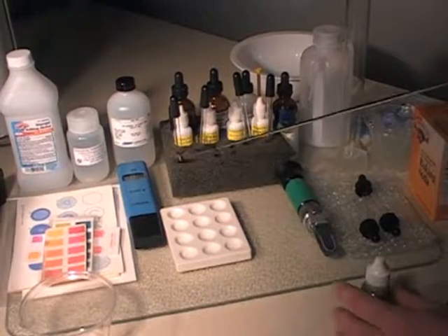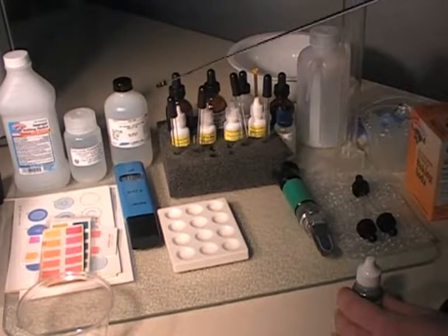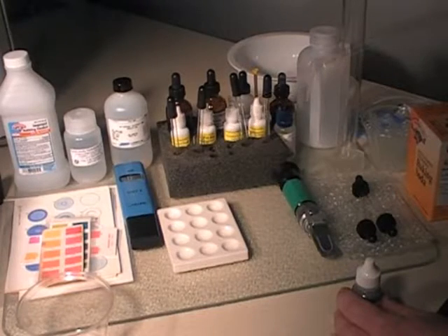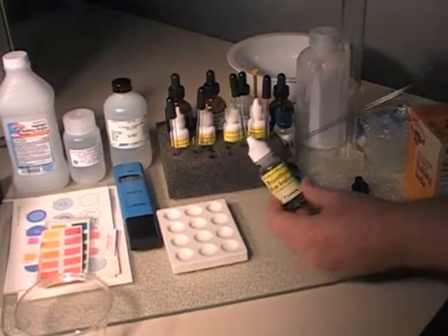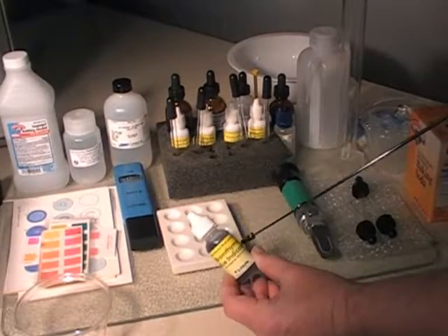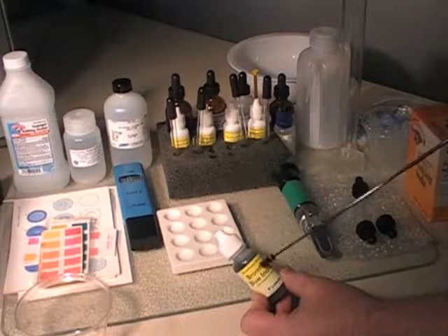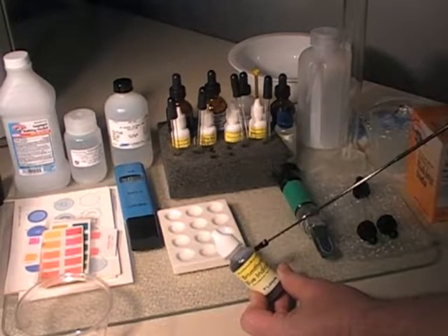What comes in this kit is a foam block, and also four pH indicators: bromcresol green, chlorphenol red, bromthymol blue, and phenol red. I also recommend getting one extra bottle of the bromthymol blue — a larger 30 milliliter bottle, since these are 15 milliliters. You use the bromthymol blue the most and will go through it rather quickly.